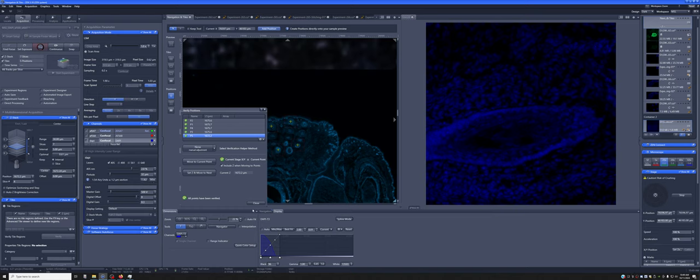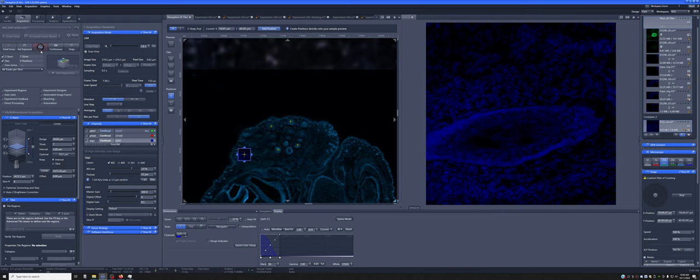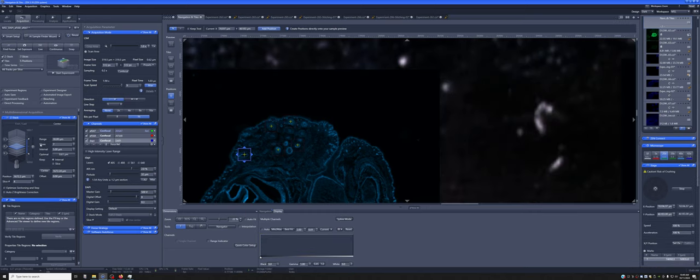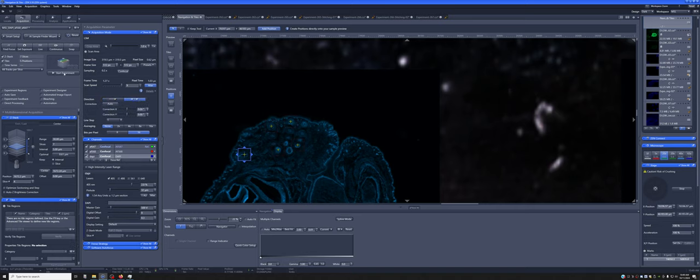So if I close this, stop here, all those Z-Stacks now I've verified that they will go through the entire block of tissue. So let me just speed it up by doing this.